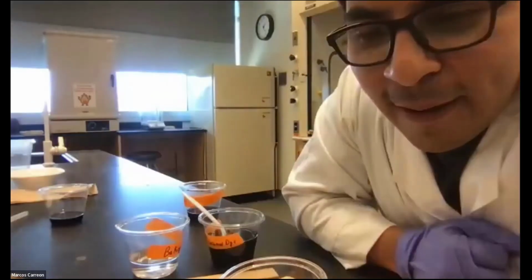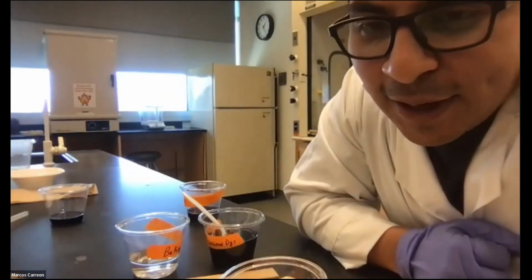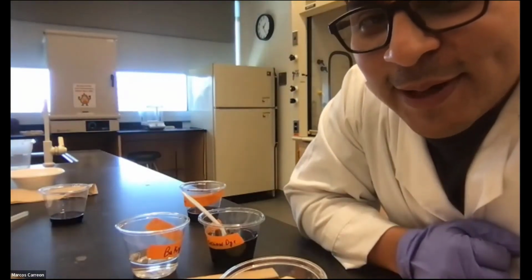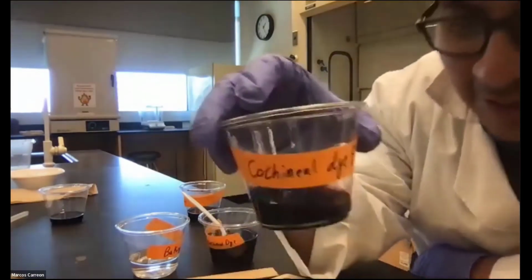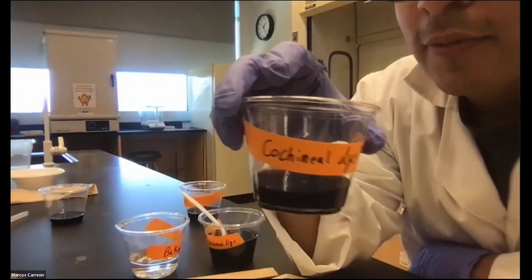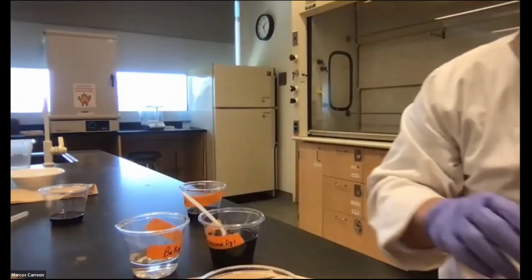All right, we'll see what happens. So I'm agreeing it's gonna be lighter. But we'll see what color it changes. So right now it's, like I said before, purplish. And we'll see what color it changes to.